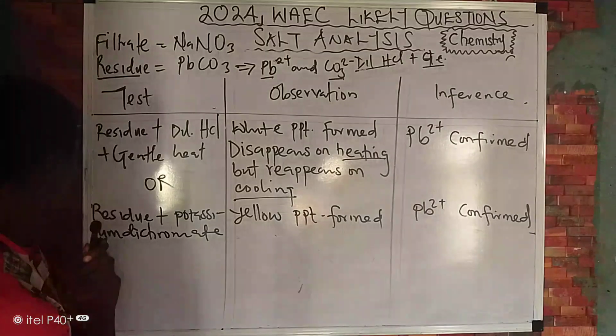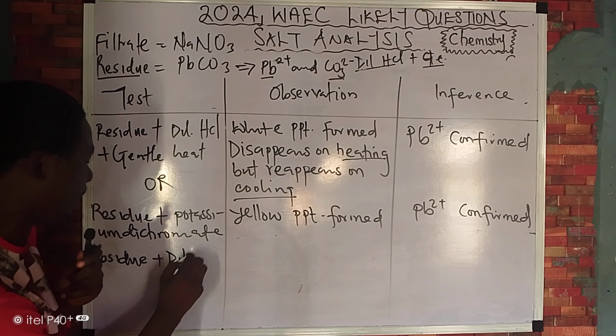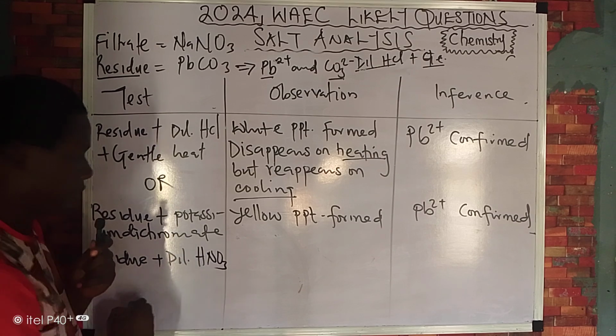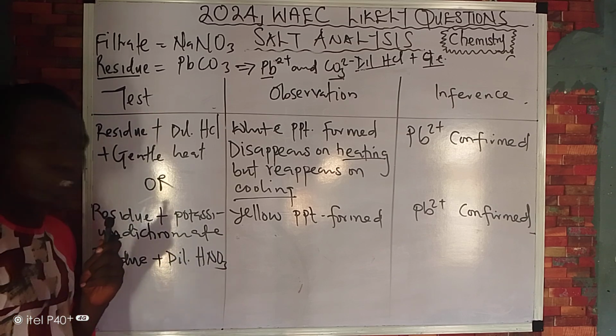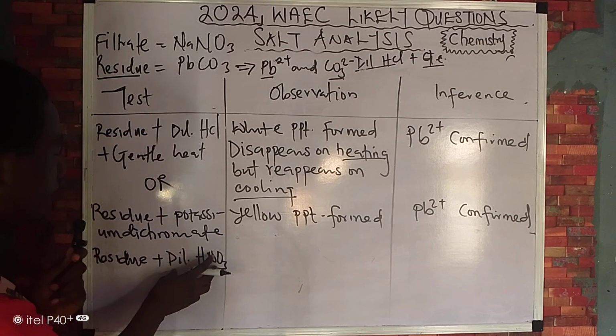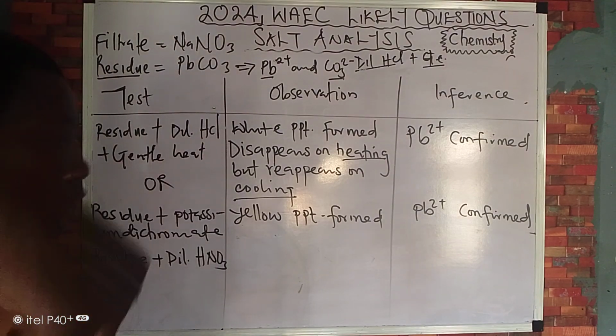So the residue plus dilute HNO3. See it? If you carry the residue and add HNO3 to it, this is what you observe.